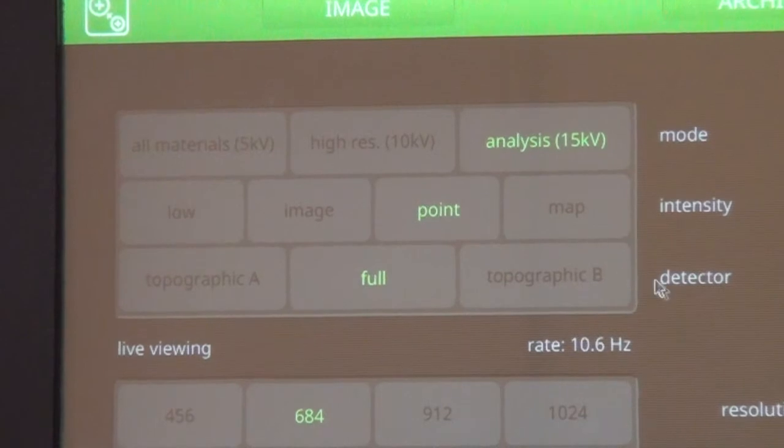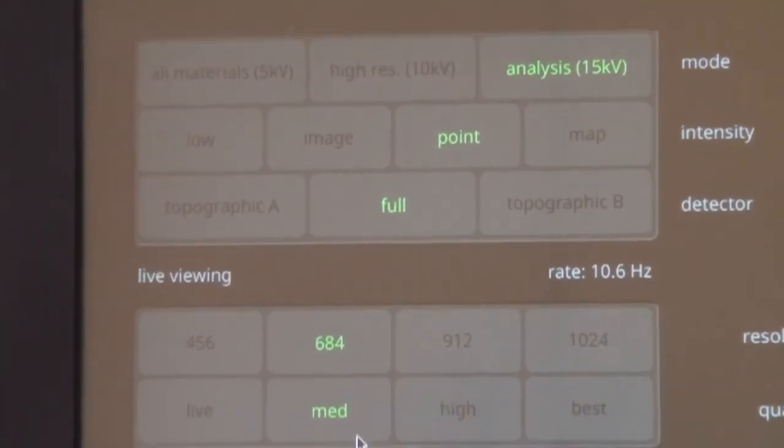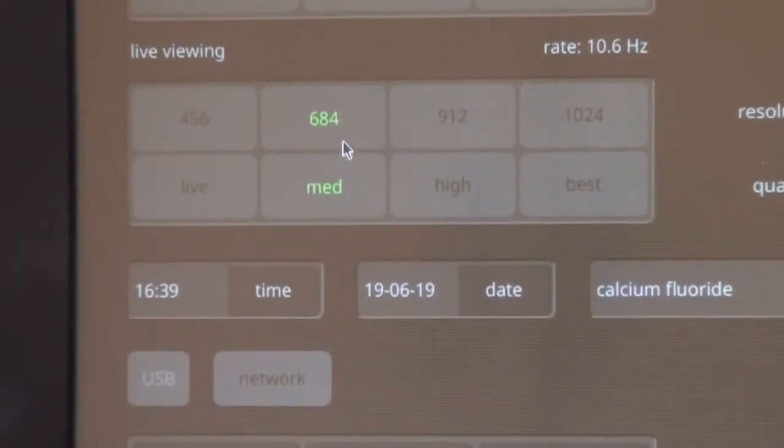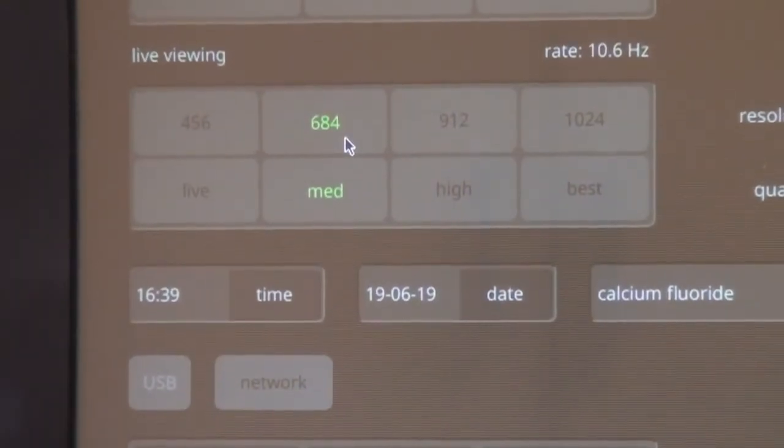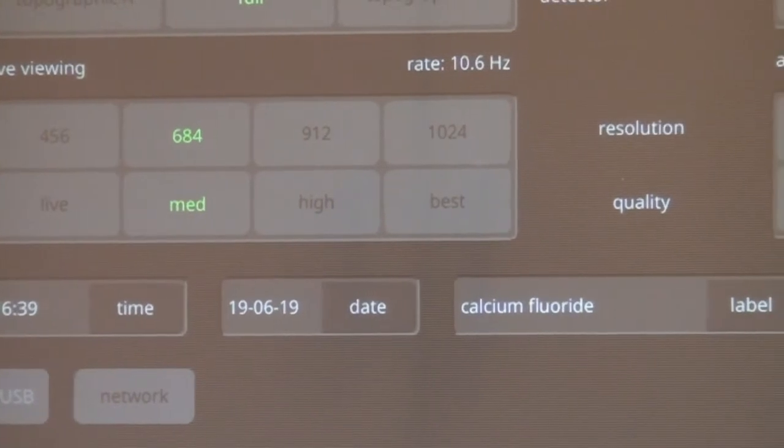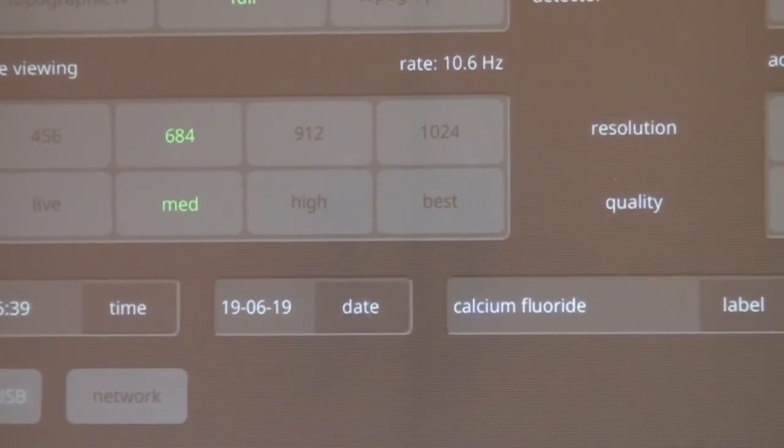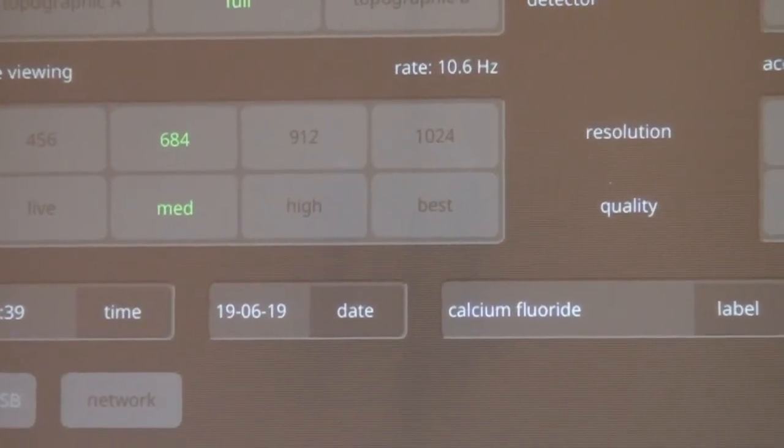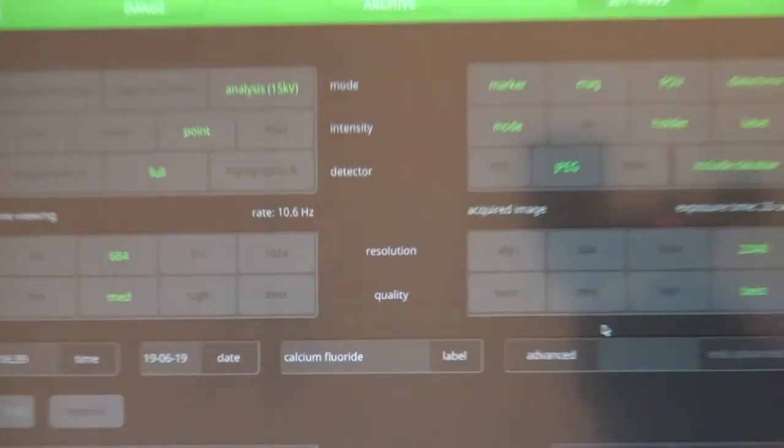We choose the full detector and optimal resolution and quality. And after the settings, we go back to the image screen.